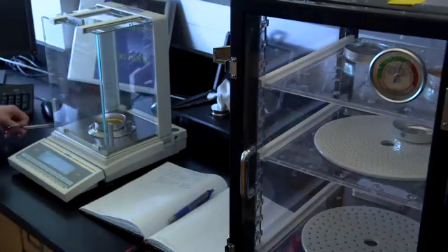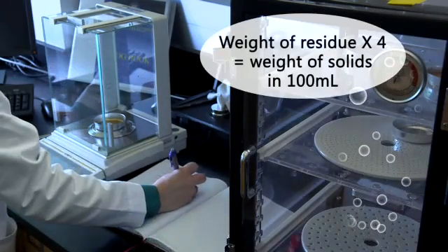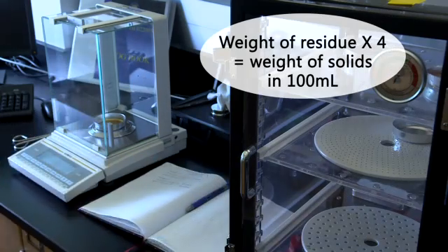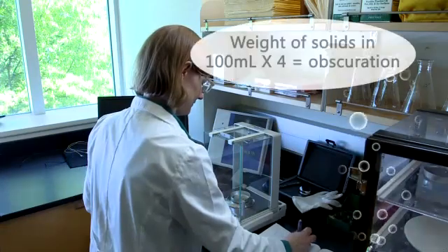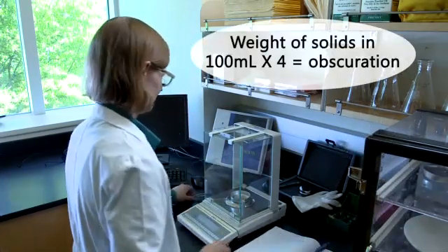Subtract the initial from the final weight to get the weight of the residue. Multiply the weight of the residue by 4 to determine the weight of solids in 100 milliliters. Then, multiply the weight of the solids in 100 milliliters by 4 again, which will equal the obscuration.